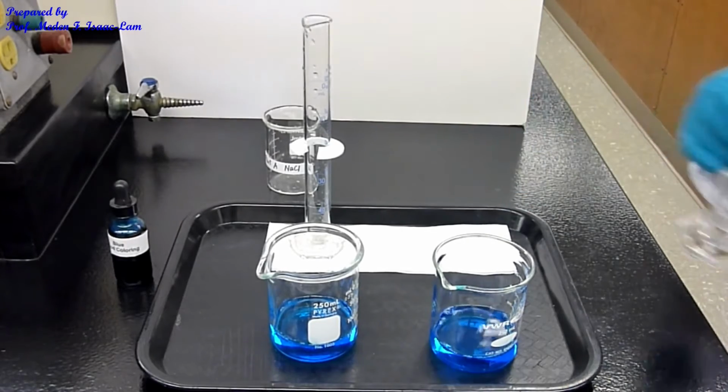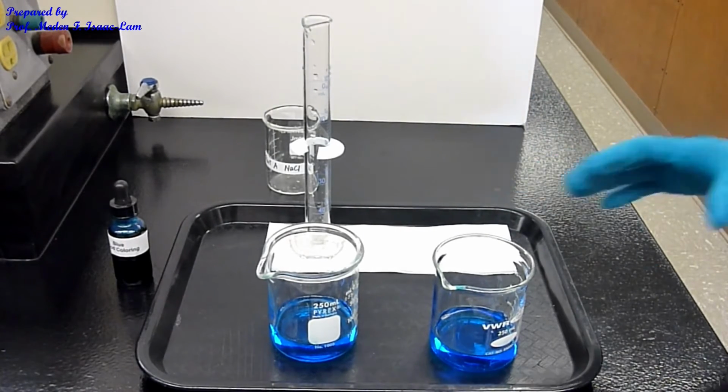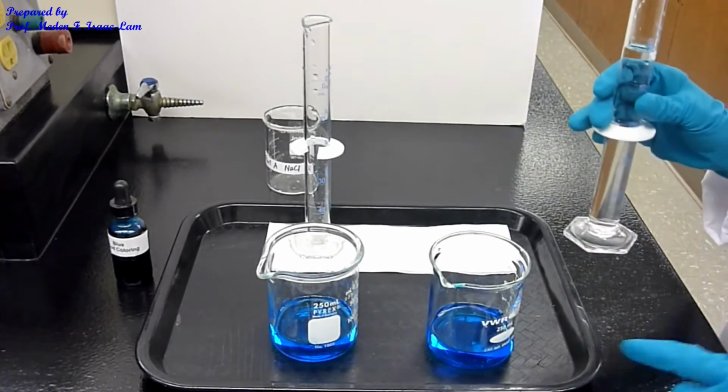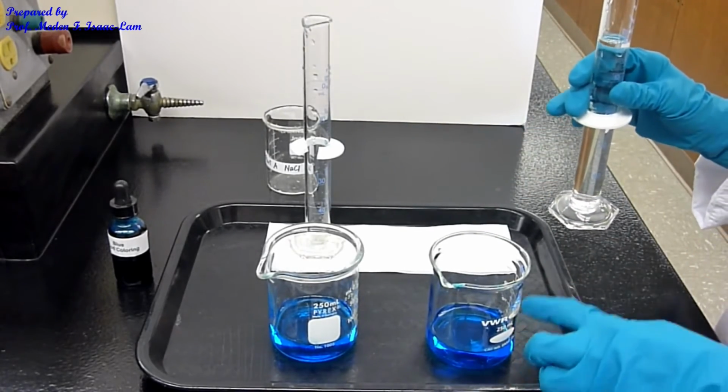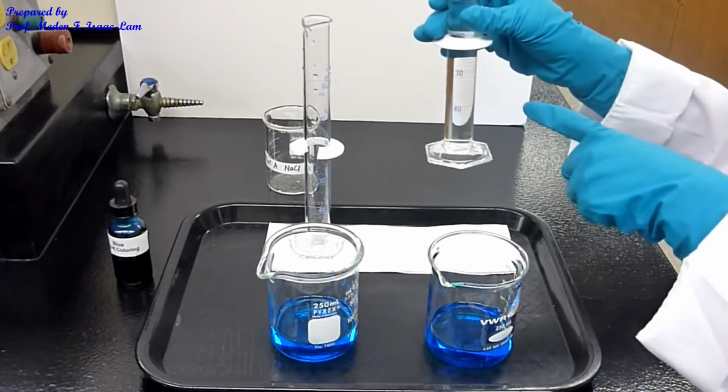Okay, so the color intensity is the same. So I now have two beakers exactly the same. I just split the previous solution. However, for beaker number 2, I'm going to put an additional 50 ml of just water.